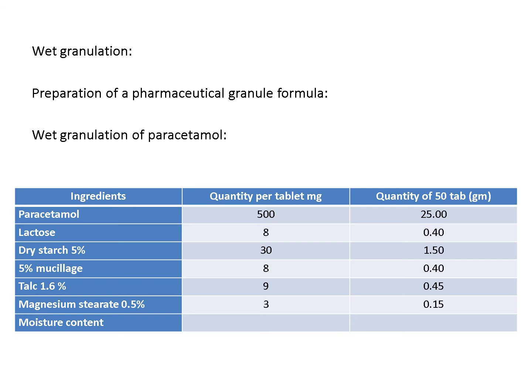5% means 5 grams of starch in 100 grams of water, 100 ml of water. So we are going to prepare 50 ml of water, so we are using 2.5 grams of starch. Because we are going to use heat in order to degrade starch, the polymer of glucose, partially into dextrin, that will make it more viscous and we can use it as a binding liquid.